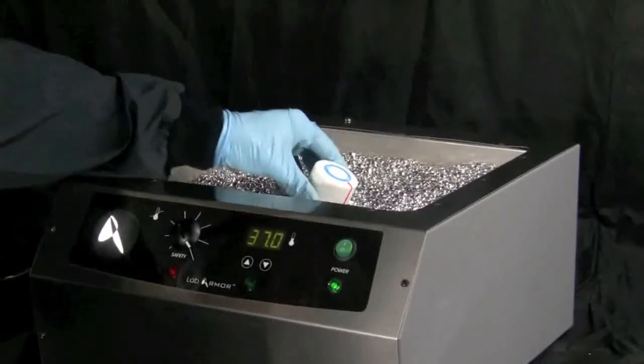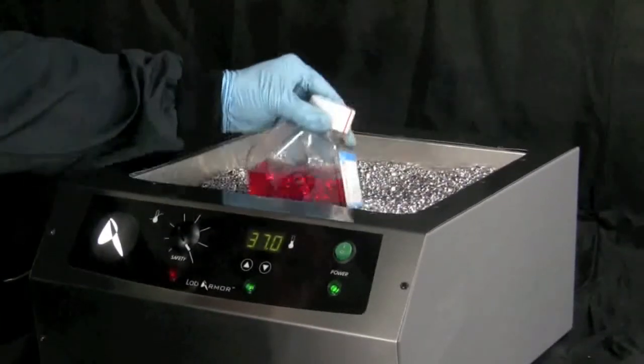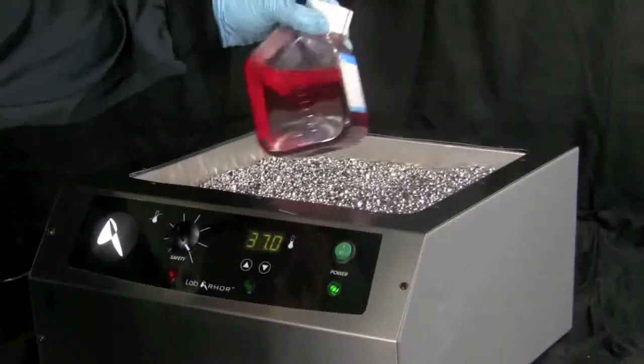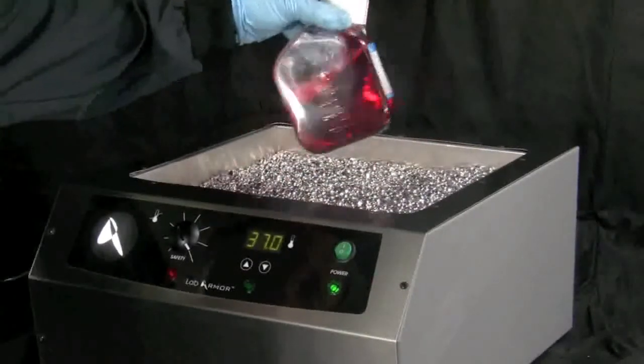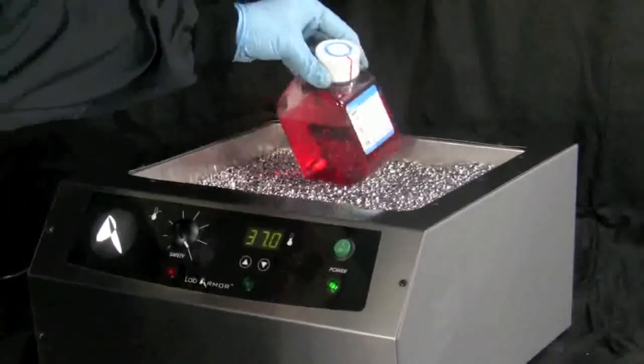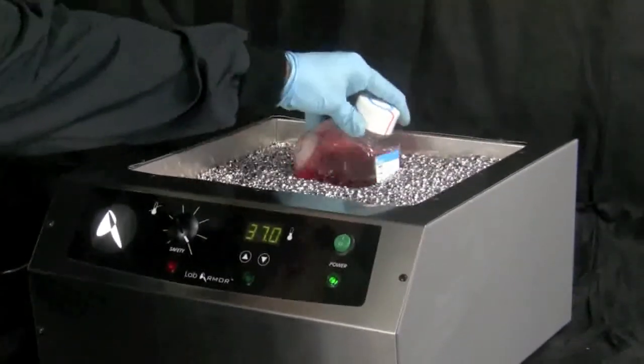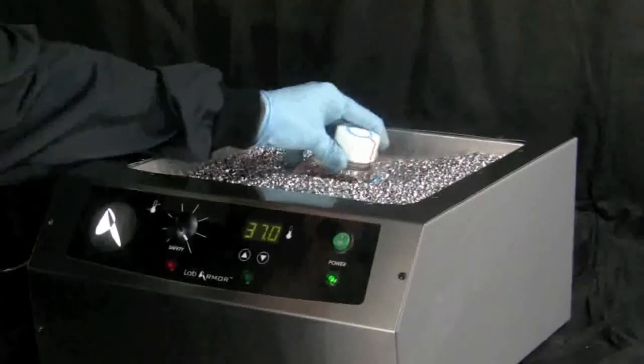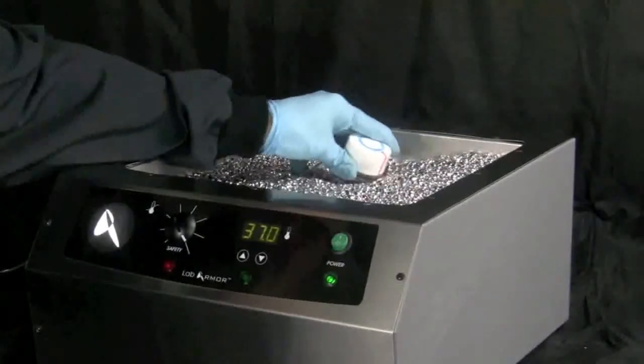Periodically agitate larger cold vessels and relocate to warmer zones in the bead bath, and when possible, fully submerge vessels in the beads.